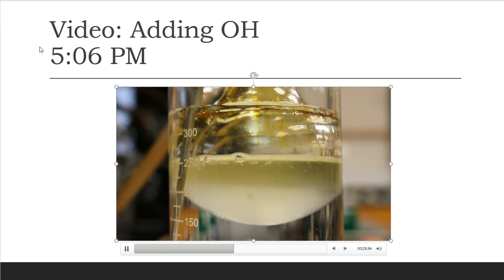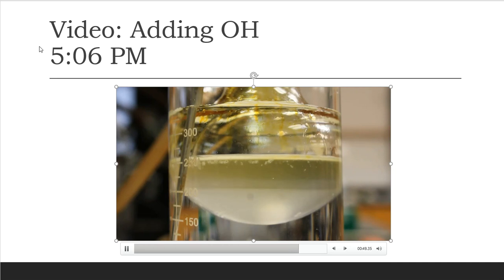So let's take a look at what happens when I add the sodium hydroxide to the reaction flask. All right, so all of the sodium hydroxide at this point has been added. Hopefully you see an observational change on your end. If so, very good for you. Again, I think it's very obvious what has happened at this step. So make note of how many layers that you see, make note of the colors that you see, make note of everything that happens in the lab. It's very important for a laboratory notebook.